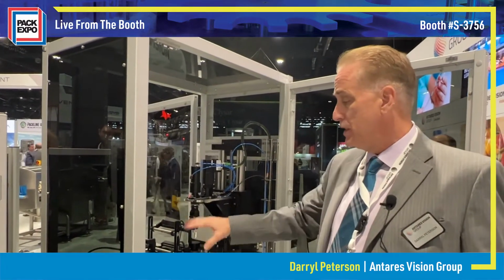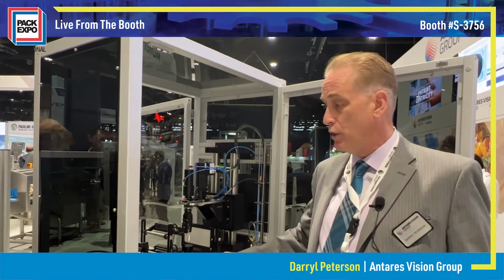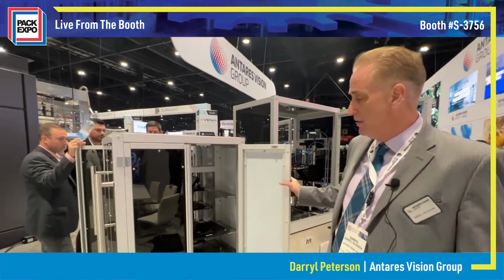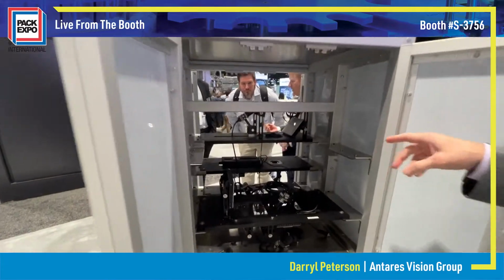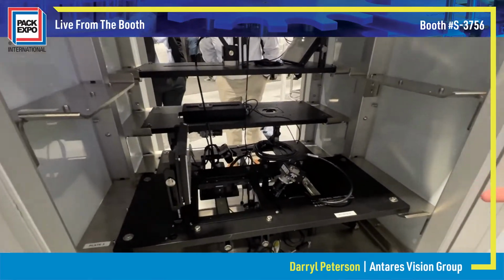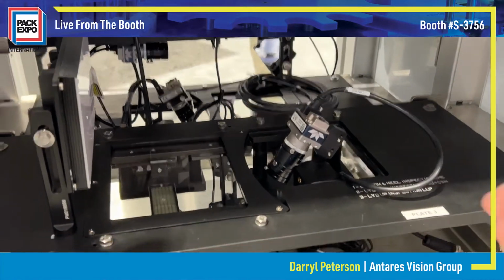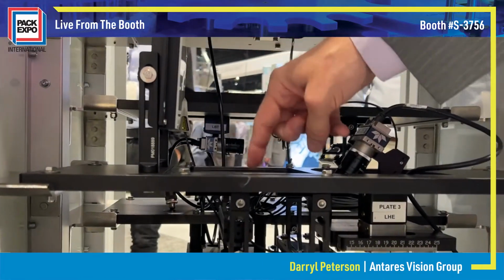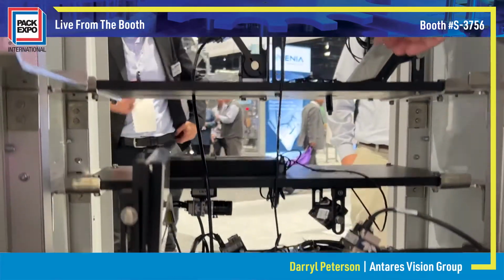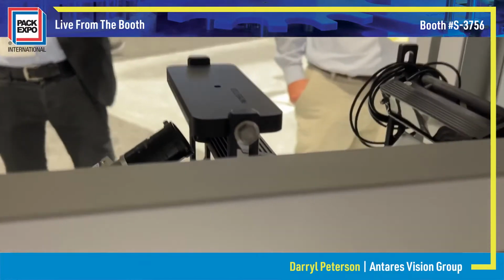So the whole purpose of this setup is for a vial to be able to look at particles. But what you'll also notice next to here is a comparable unit, which has inside of it many different stages set up for different kinds of inspections that you would see inside an automated inspection machine. You'll notice a camera here pointing down towards lighting below and on the side. We have some up here where the camera is pointing up, and they list on the side exactly what they're for.